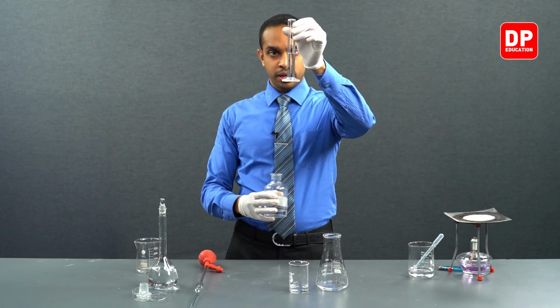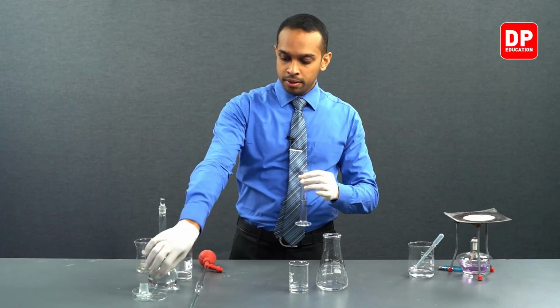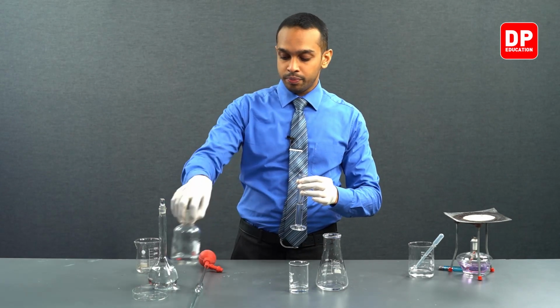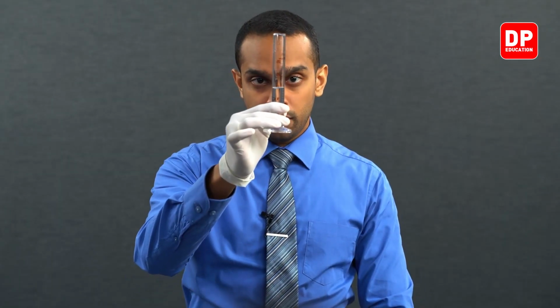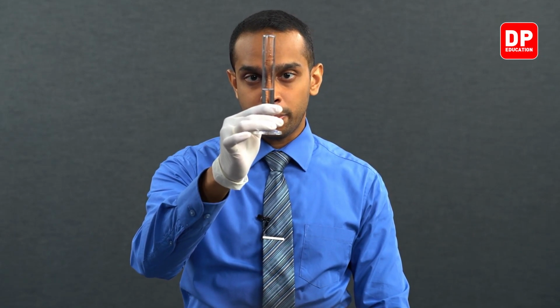Each time you make a measurement, especially using a measuring cylinder or a burette or a pipette, you have to make sure that you bring the meniscus to your eye level to see if you have measured it properly.